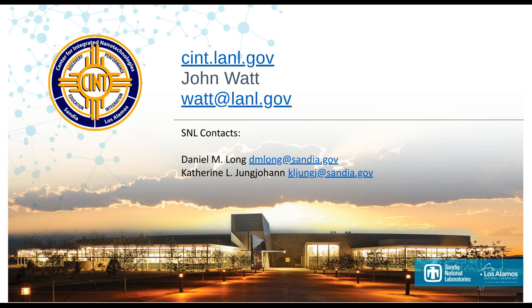Thanks. Yeah, quite a few actually. I guess as Dan alluded to earlier, for each sample it's very dependent on the nature of the material for things like milling rates, and that's not just for making the cuts, but also things like redeposition. For soft matter, redeposition can be quite a challenge.